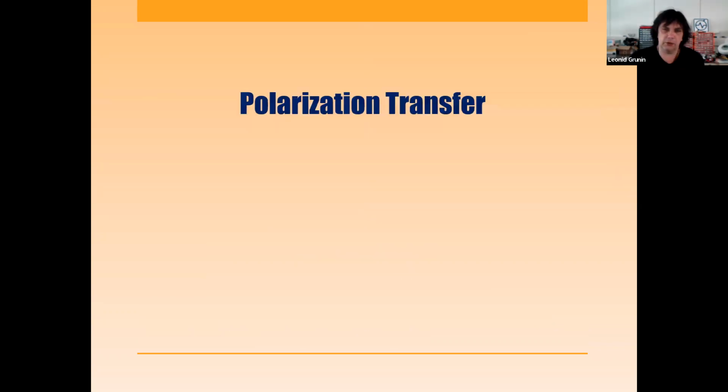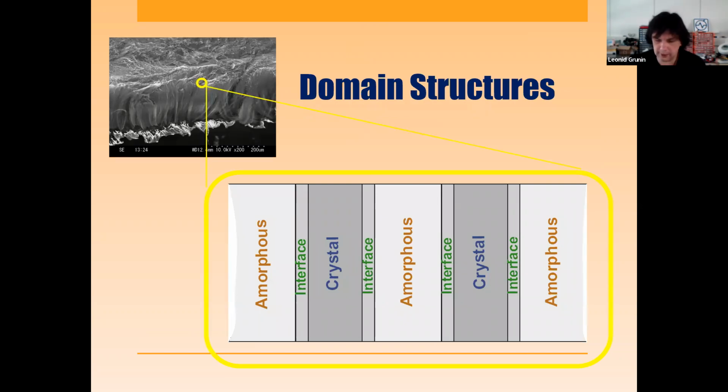And now let's come to the final theoretical and somehow practical part of our lectures. It is the transfer of magnetic polarization inside the sample, which happens due to the effect of spin diffusion. As we talked about already, any rigid, any solid sample normally is not continuous. It has a heterogeneous structure. For a general case, the structure can contain a crystal part, an amorphous part, and something in between that we call the interface.